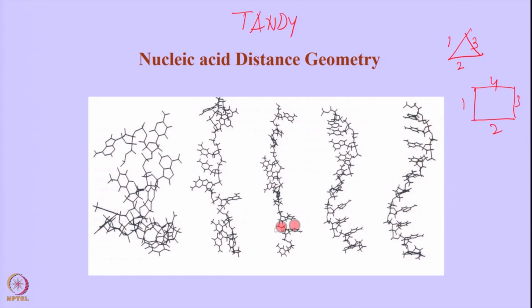Helical structure, now it is a single strand here. In this case it was a single strand. Now what you do is, after that you can add constraints of the hydrogen bond base pairs, then you can put base pair constraints. Once you put the base pair constraints and calculate the structure, then you will get the duplex structure for the molecule depending upon the sequence you have.